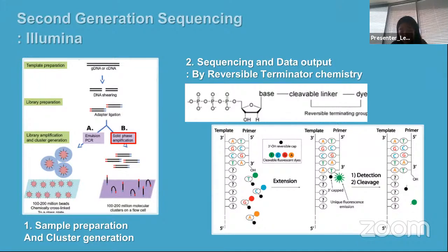of the next base. These nucleotides are chemically blocked such that their incorporation is a unique event. An imaging step follows the base incorporation step, then the blocking group is chemically removed to prepare each strand for the next incorporation by DNA polymerase.